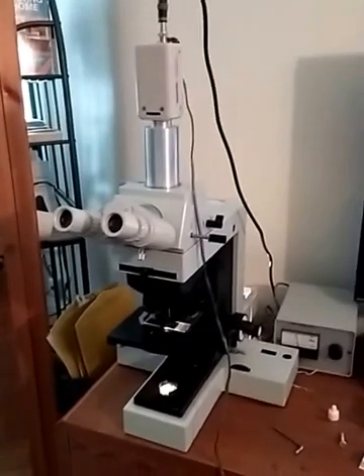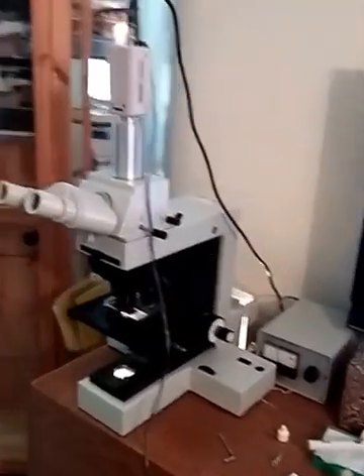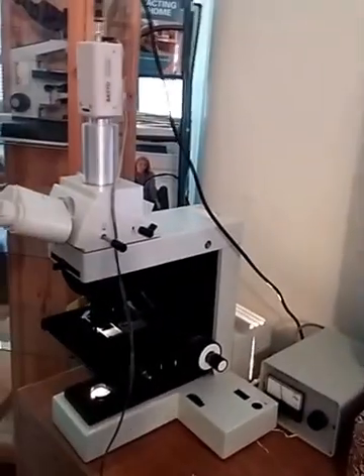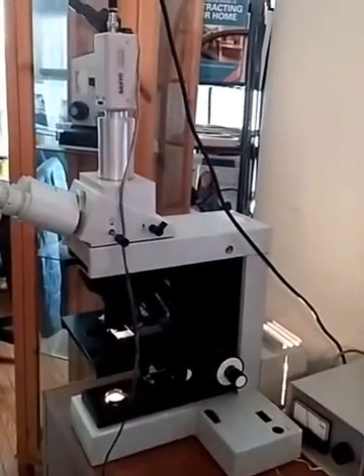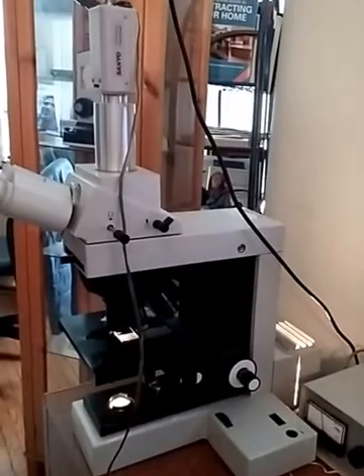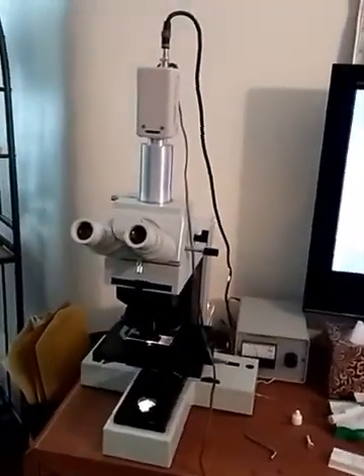Hi there. This is going to be a demo of the Zeiss Yennevel. This is a lab quality scope. It's top of the line, Rolls-Royce objectives on it. It's in excellent shape. You can see from just walking around it here — trying to give you an idea.